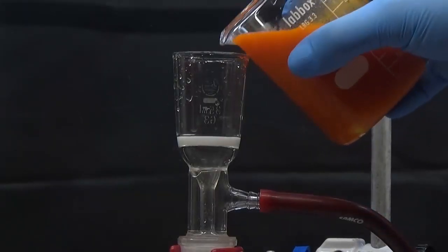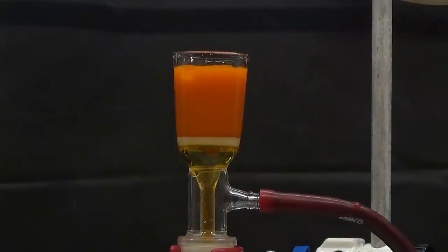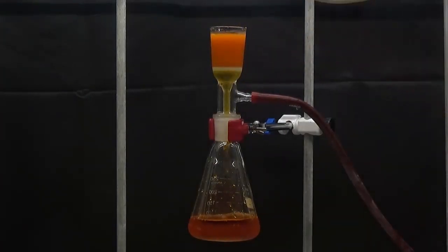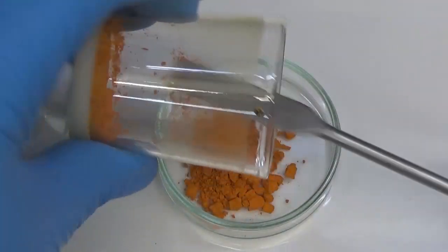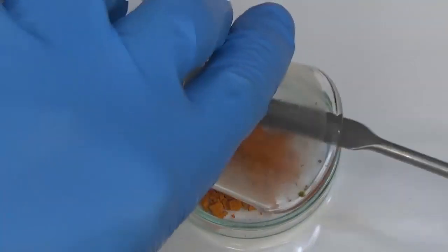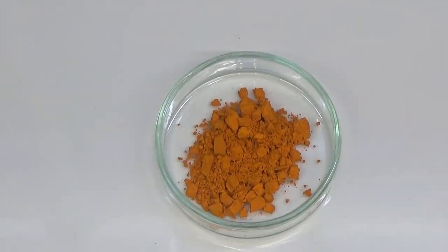Collect the precipitate by vacuum filtration and wash two times with a little icy water. Leave to dry in an oven at 80°C or in a desiccator. The quantity of product obtained was 0.8 g. The theoretical melting point for isatin is 196 to 198 degrees Celsius and the actual melting point for our isatin was 152 degrees Celsius.